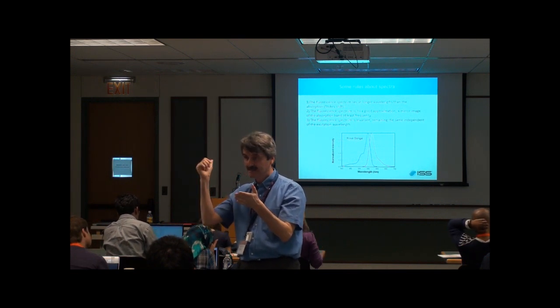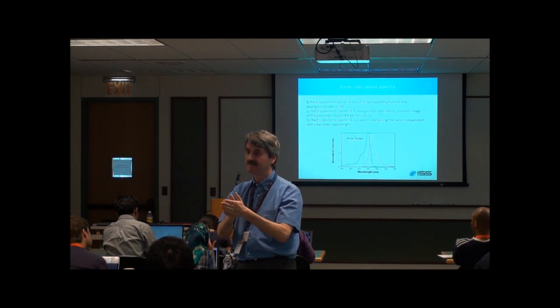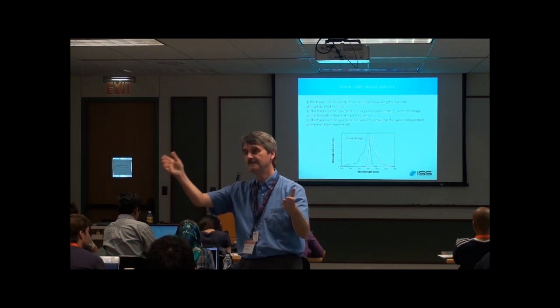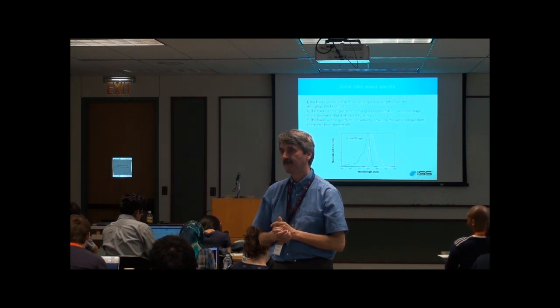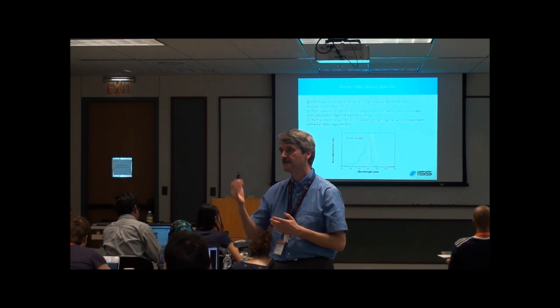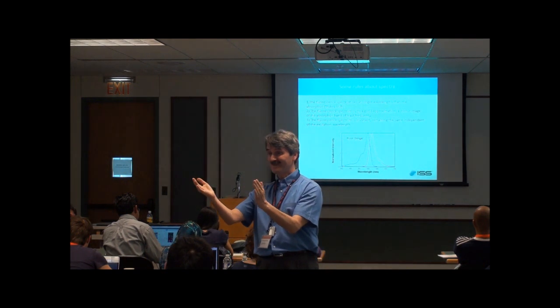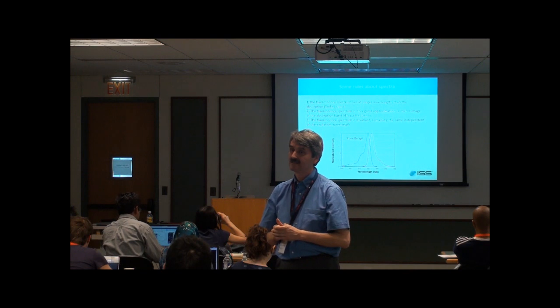An LED, like the one used, is almost 1 nanosecond. So there is this mathematical operation, convolution, where we convolve the data acquired with the excitation source. It seems to work really well, because your excitation pulse length is basically the same as the fluorescence lifetime. Right. You also see it when you measure 77 picoseconds on the rose bengal. It's almost the laser diode in that case.